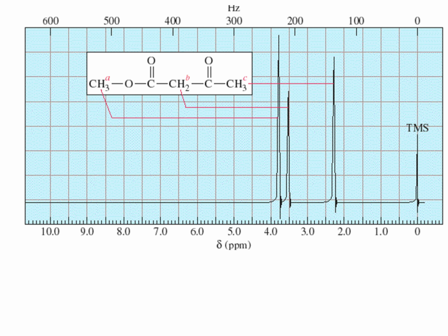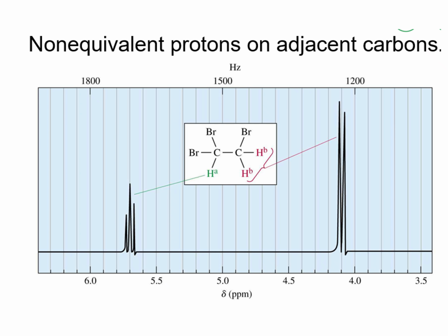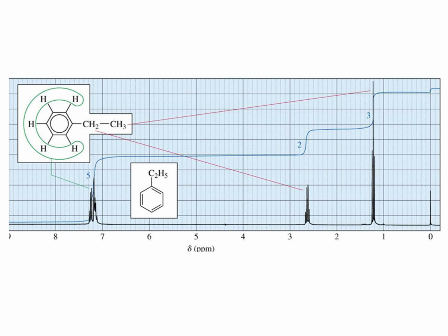Let's practice this yourself. Another solution, just practice this. For different environments, different peaks will appear. You can see another one. All of them will have the same environment.